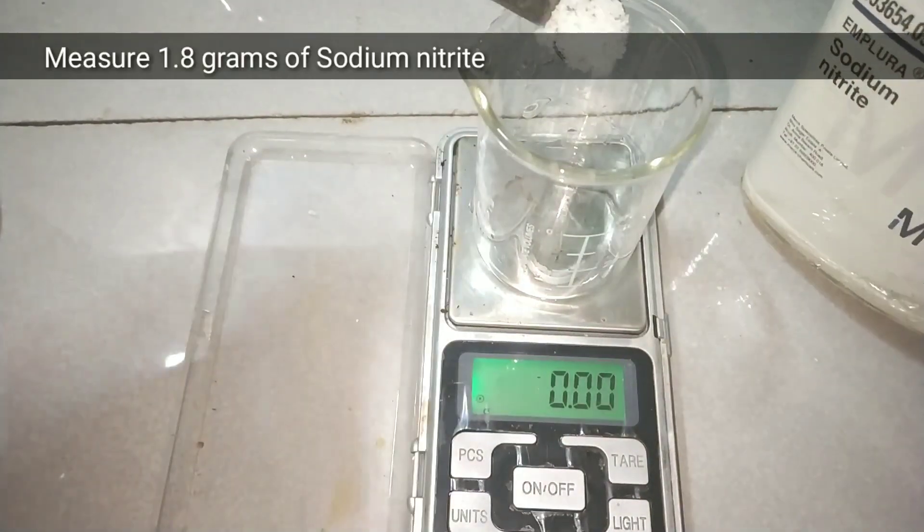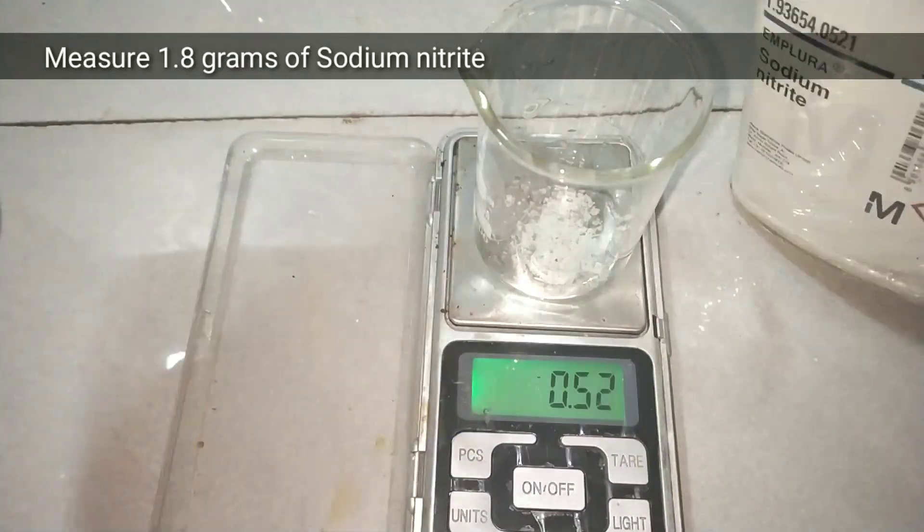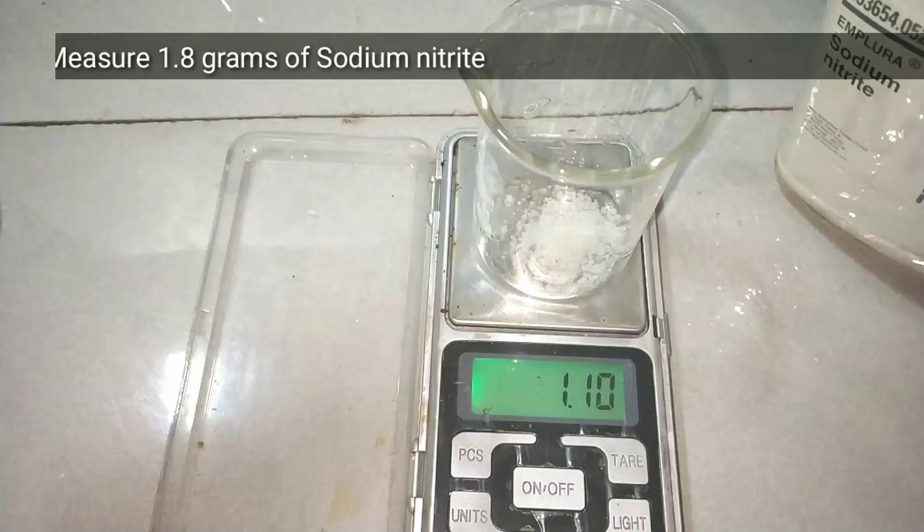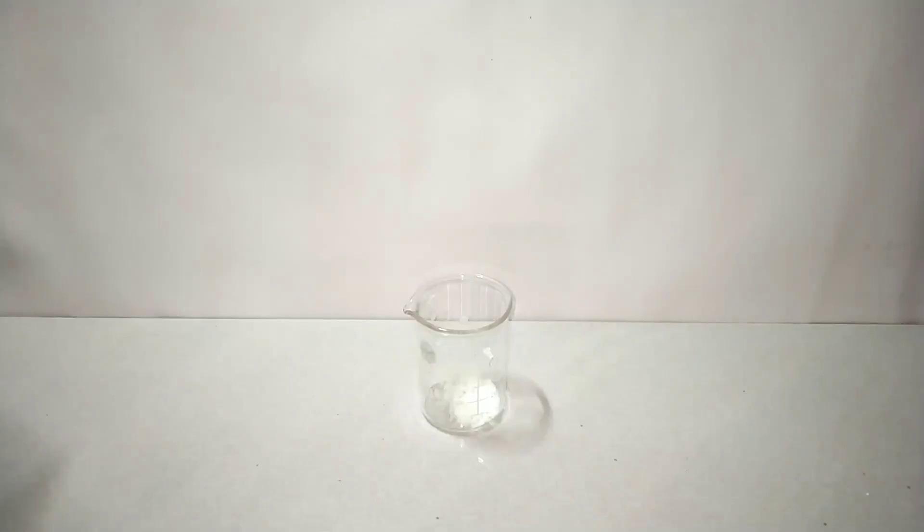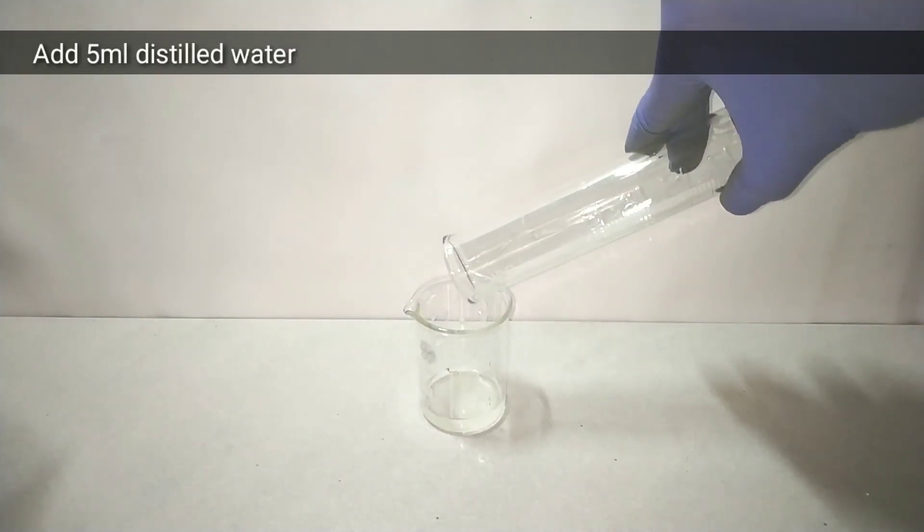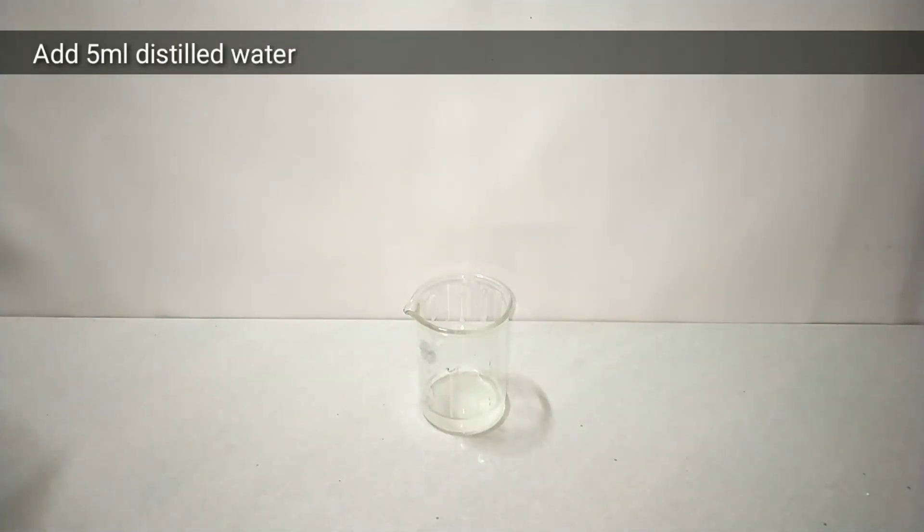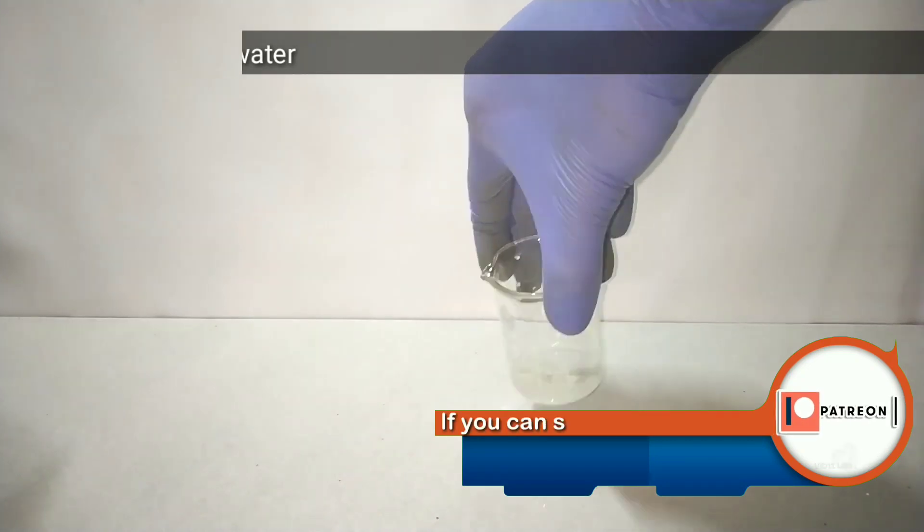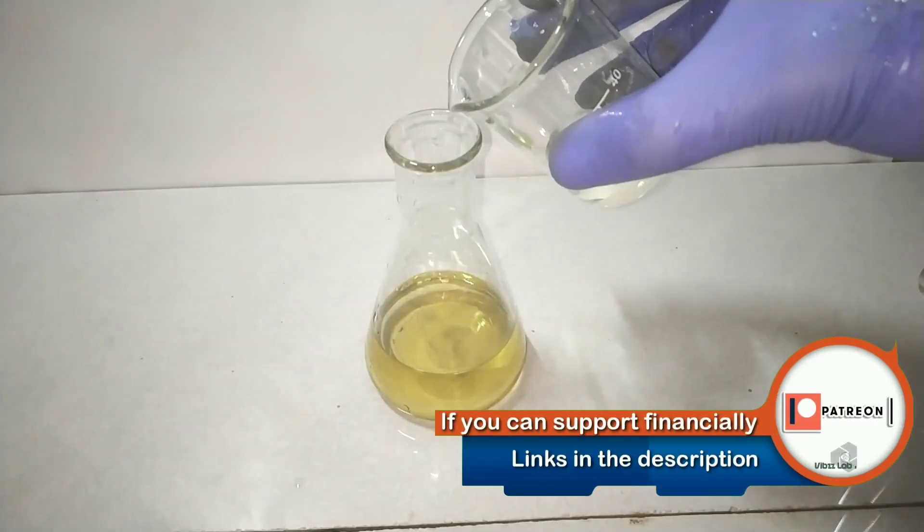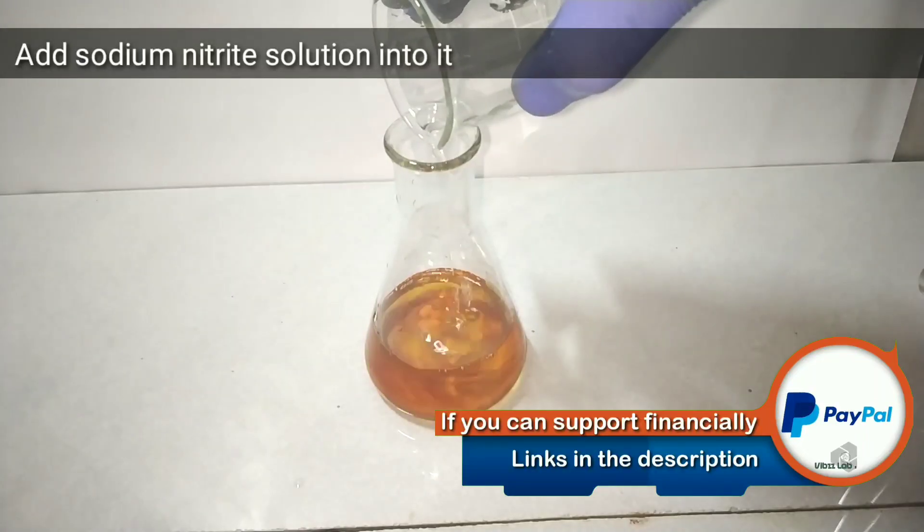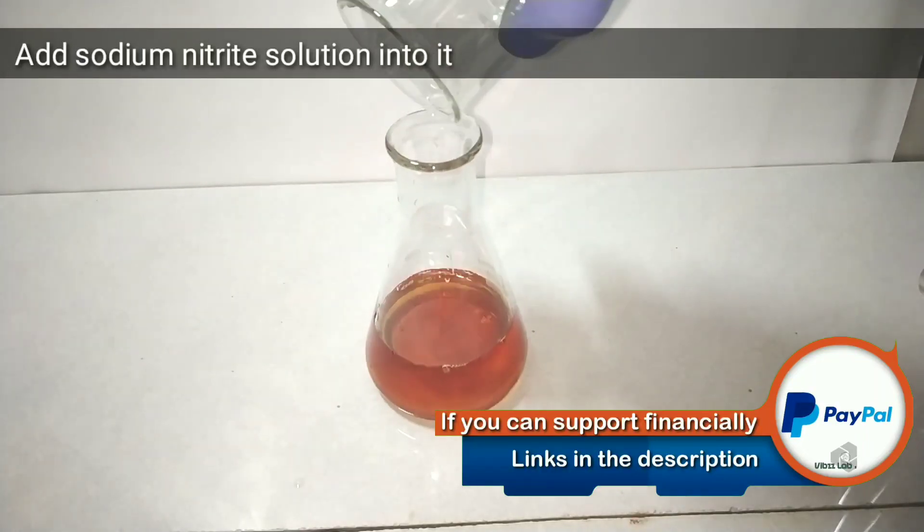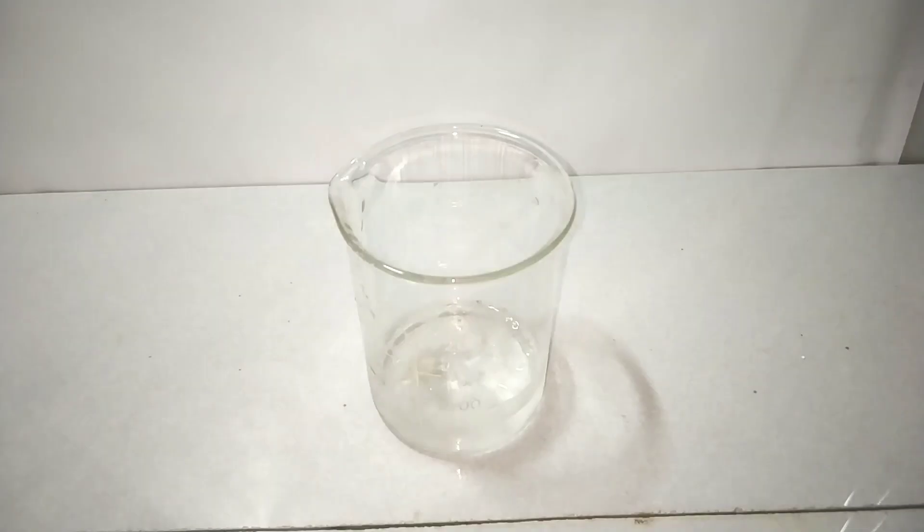Now we measure out 1.8 grams of sodium nitrite. It is sodium nitrite NaNO2 and not nitrate. Into that add 5 ml of distilled water and mix to make a solution. This sodium nitrite solution we add into the previously boiled and cooled solution of sulfanilic acid and sodium carbonate.